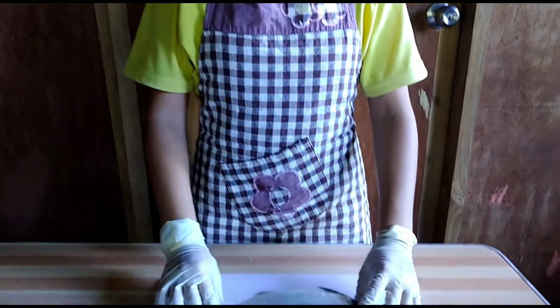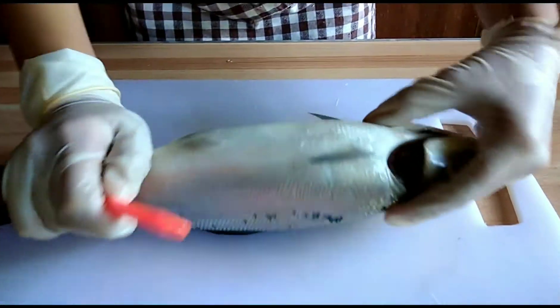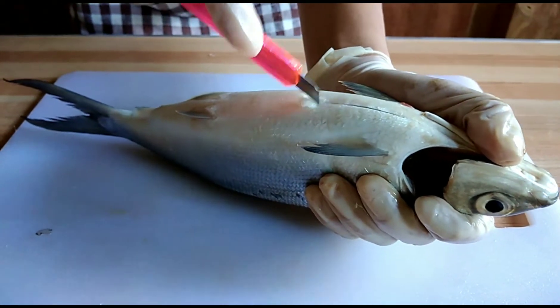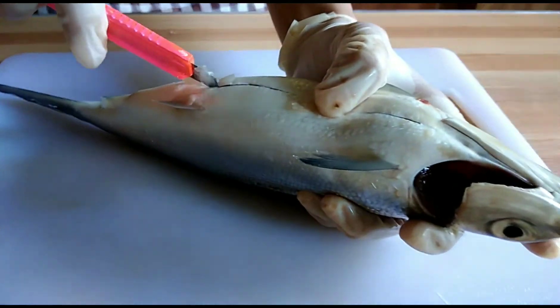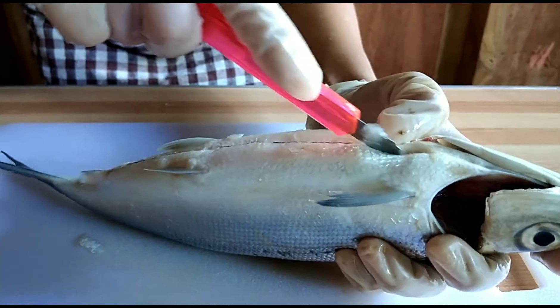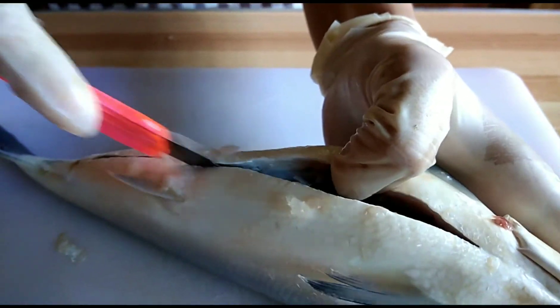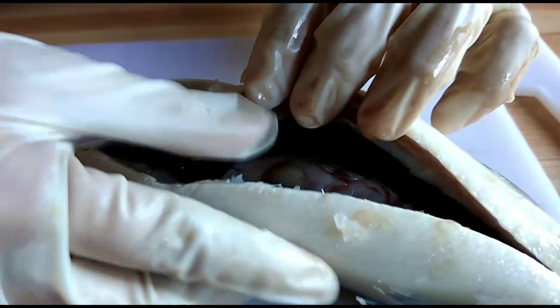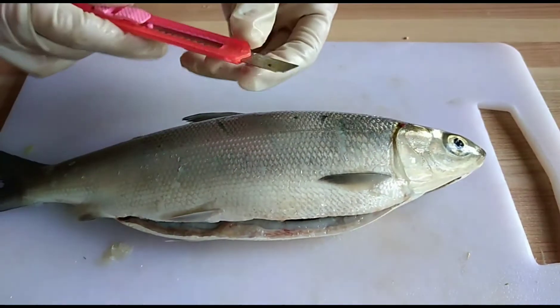Now I just have to make an incision from the base of the operculum to the anus. I need to cut a lateral incision in order to see the organs clearly.